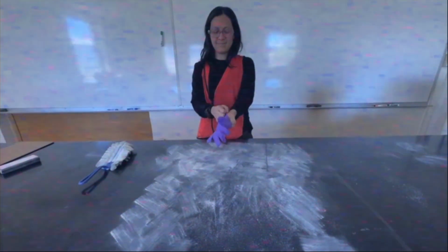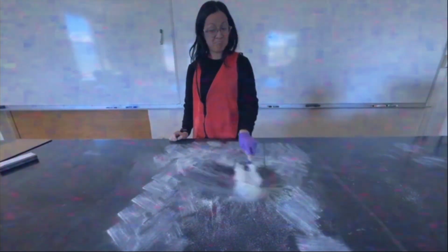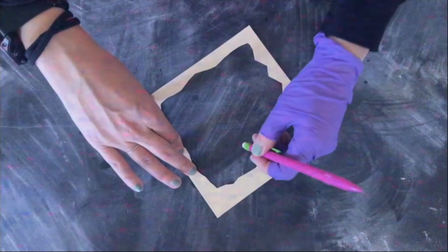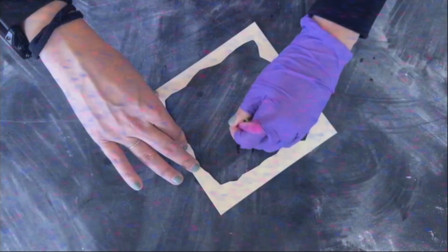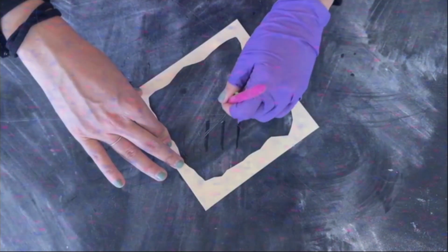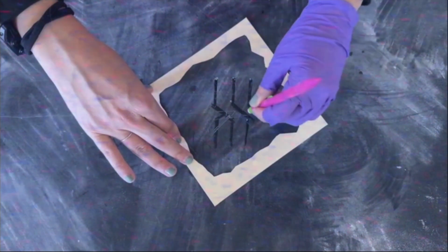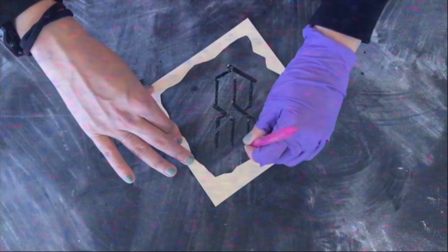With the wrong equipment assembled, the industrial hygienist begins sampling. Let's observe the technique. The dust is now everywhere. The sampling area has been defined poorly. Its dimensions are uncertain. Its boundaries are theoretical. Having abandoned accepted sampling practice, the industrial hygienist attempts to follow the S-wipe pattern. Instead, they have recreated the infamous symbol many of us spent far too much time drawing in middle school.